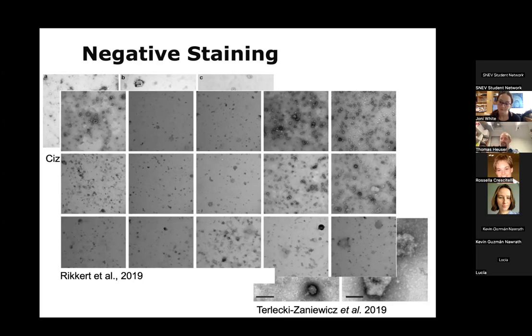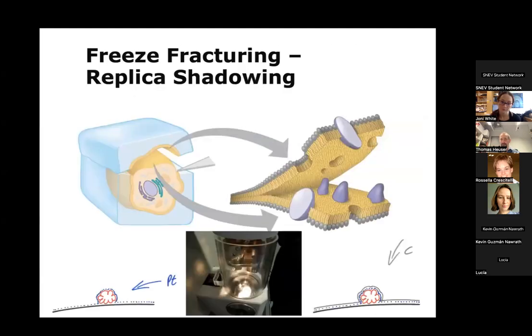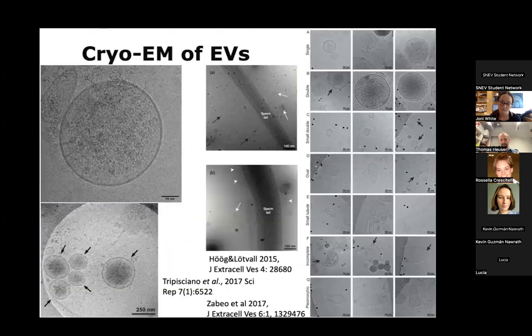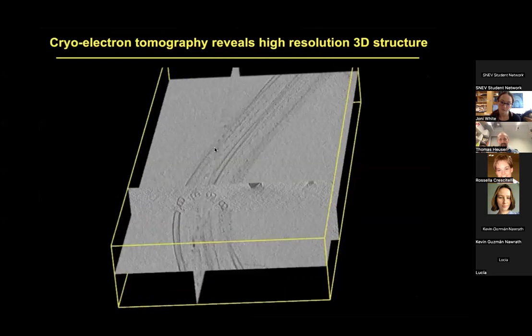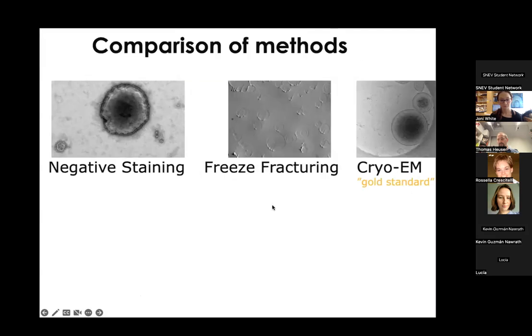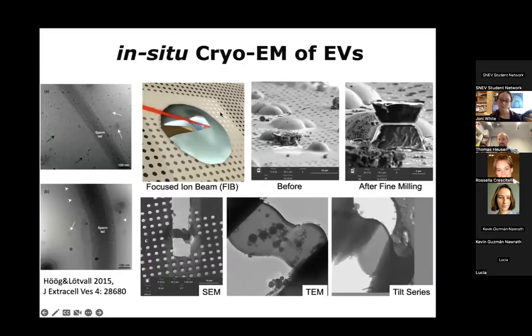To do this in cryo is possible. I don't think anyone has done it so far. And this would then be exactly what I showed here at the very end, this cryo-FIBSEM approach. So with this, you could imagine that this here would be your eukaryotic cell, and you would cut a thin slice somewhere just in the middle, and then basically analyze this little slice here in a cryo-TEM, or maybe even do cryo-electron tomography on it to get the 3D structure, and then to study these structures.